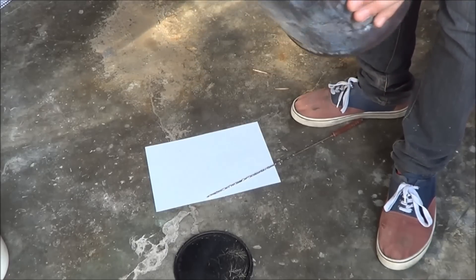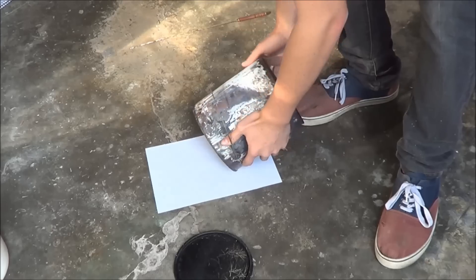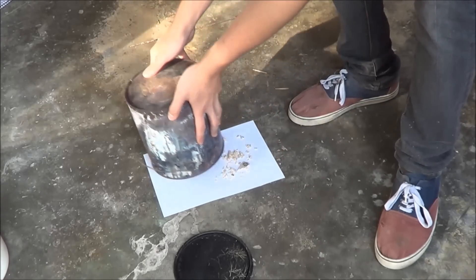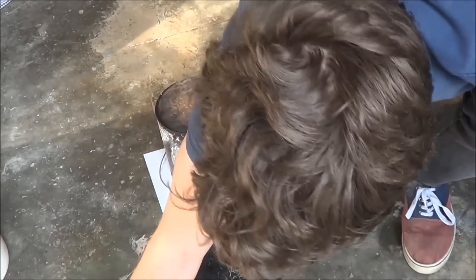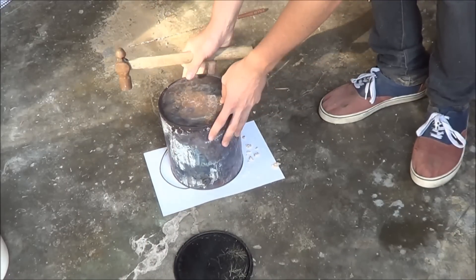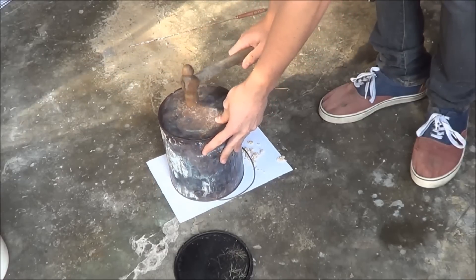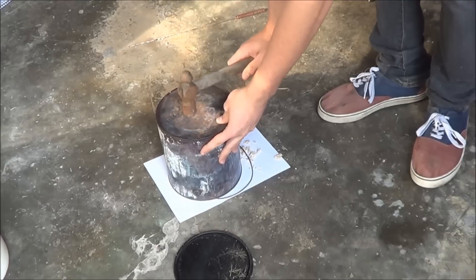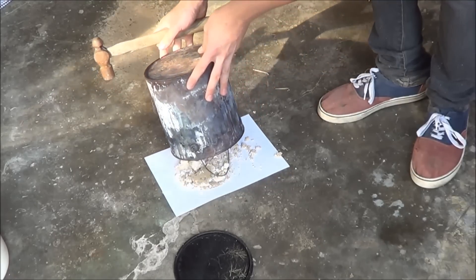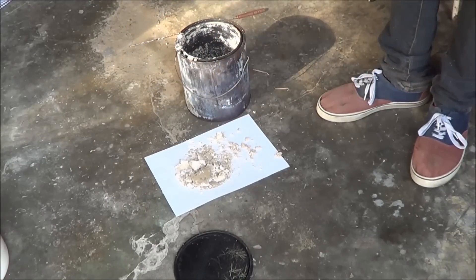The first challenge is getting it out of this container, because I want to reuse this paint tin. Hopefully I can just ever so gently tap it out of there. It's looking good.